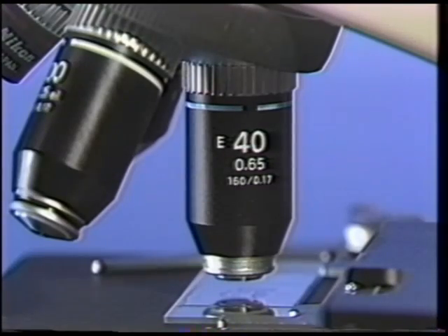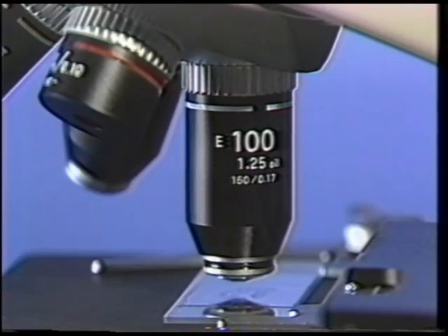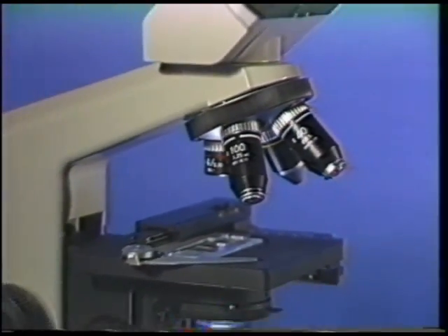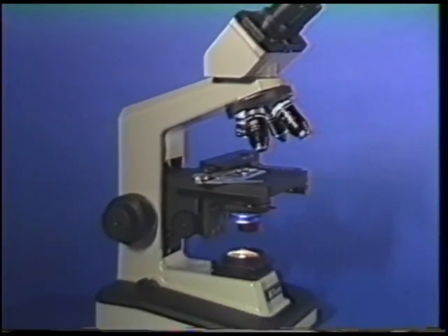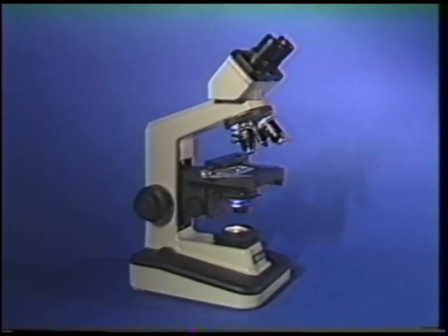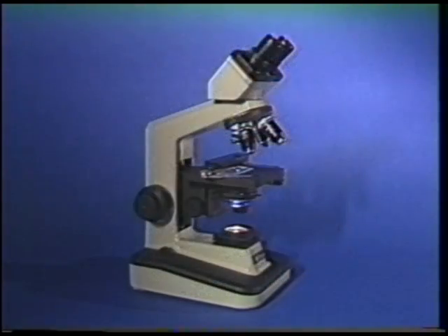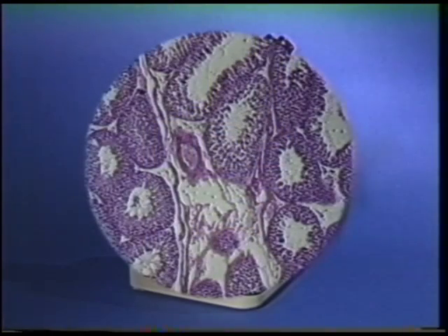Immersion oil is required when using the higher magnification 100X objective. Nikon CFE Acromat objectives are used with the AlphaFoT II microscope for standard bright field observation. They are used for routine microscopy, offering superb resolution, color correction, and crisp, high contrast images of the specimen throughout the high eye point wide field of view.